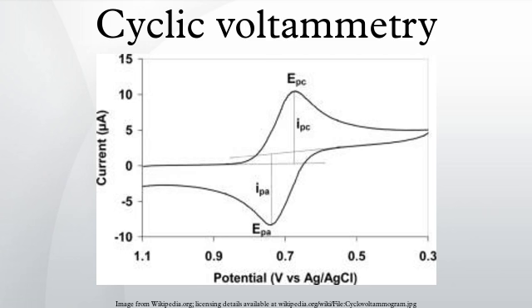Applications: cyclic voltammetry has become an important and widely used electroanalytical technique in many areas of chemistry. It is often used to study a variety of redox processes, to determine the stability of reaction products, the presence of intermediates in redox reactions, reaction and electron transfer kinetics, and the reversibility of a reaction. CV can also be used to determine the electron stoichiometry of a system, the diffusion coefficient of an analyte, and the formal reduction potential of an analyte, which can be used as an identification tool.